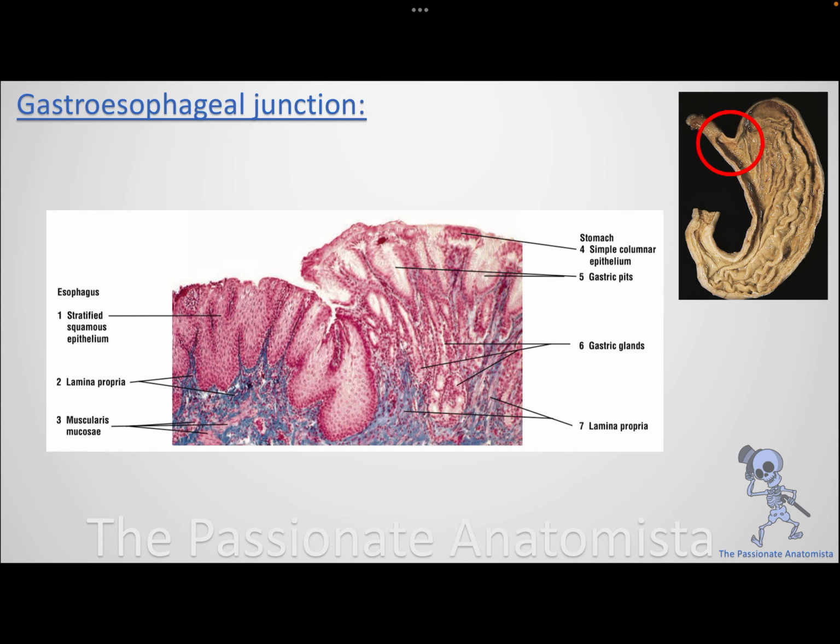This is a real histological picture to show you how the stratified squamous epithelium, all this blue, I think they are for collagen fibers, because this is a special stain. And this gives me an idea that this is the lamina propria, the supportive connective tissue for my epithelium. And this is a stratified squamous. And as I move on to here, this is a simple columnar epithelium.